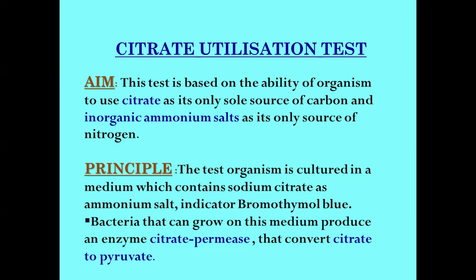In the previous three tests, after 24 hours or 48 hours of incubation, we are adding some additional reagent, but this test we are performing directly in citrate agar medium. That is the reason it is called IMViC: indole, methyl red, Voges-Proskauer, and citrate agar medium. That's the reason for the IMViC I was already explaining in the first slide.